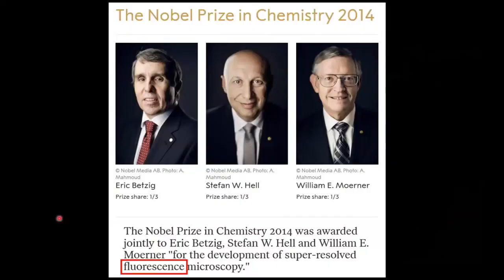In 2014, the Nobel Prize in Chemistry was given to three people, Eric Betzig, Stefan Hell, and William Moerner, for the development of super-resolved fluorescence microscopy. At that time, even I was curious why it was in chemistry, not physics, since optics should be counted as physics. The most important information here is fluorescence microscopy. Even though we are talking about super resolution today, all the technologies are based on fluorescence technologies or fluorescence microscopy.